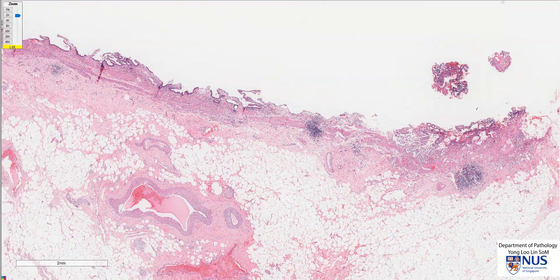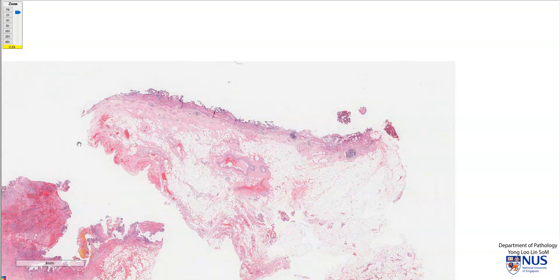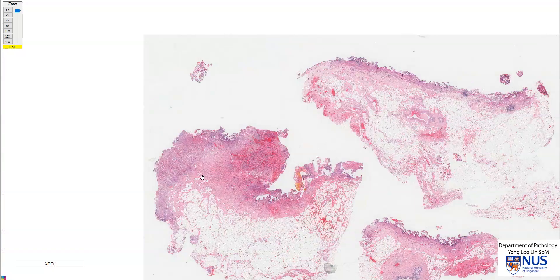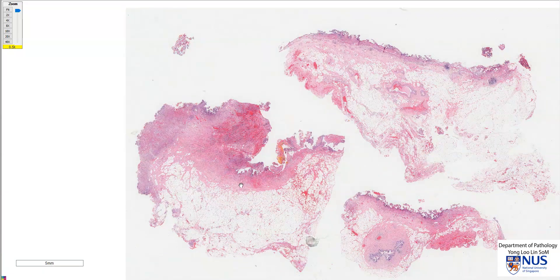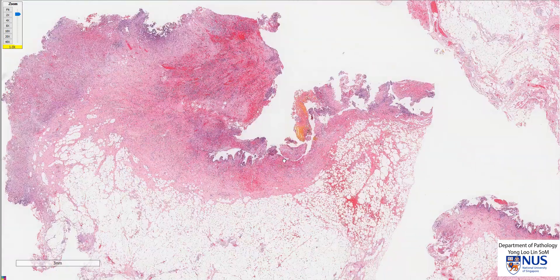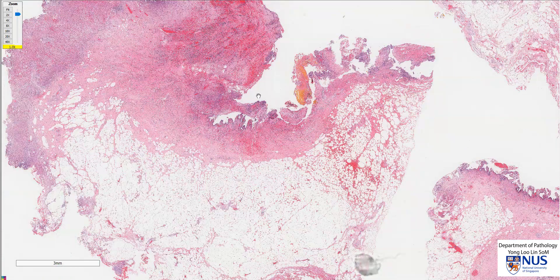This is evidence of some degree of fibrosis in the subserosal tissue, and these are the features of chronic cholecystitis. Let's move on to this piece, where at low magnification there are a lot of very reddish areas. This is the mucosa — the luminal surface — here is the muscle layer, and this is the subserosa.